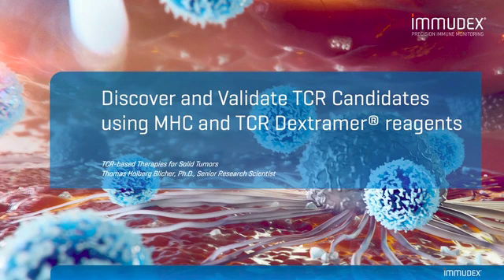Hi, my name is Thomas, and in this presentation, I'm going to tell you about how to discover and validate TCR candidates using MHC and TCR Dextramer reagents as provided by Immudex.